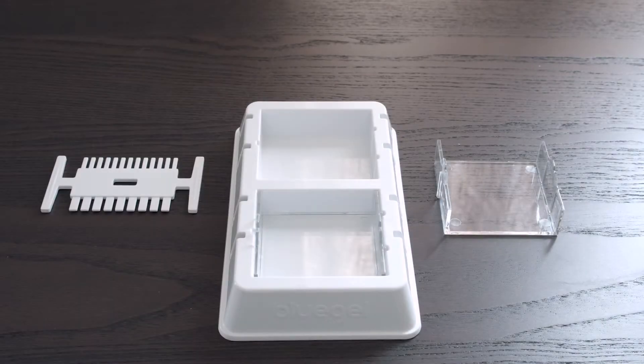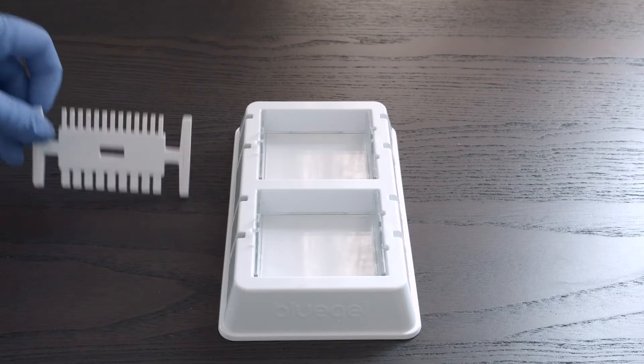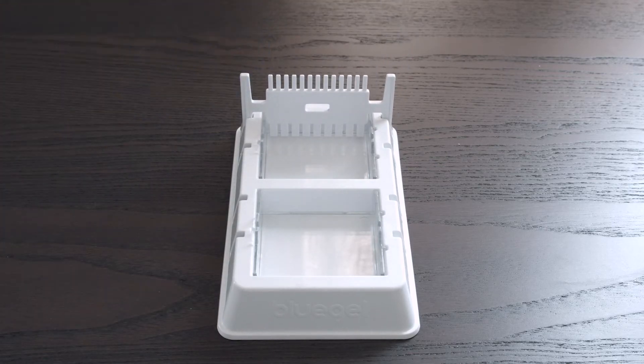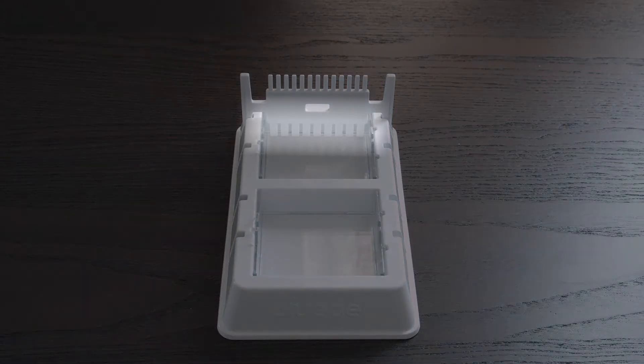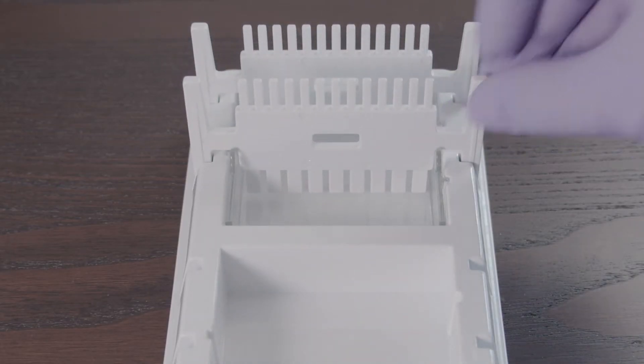Before pouring your gel, you want to set up your gel casting platform. Place the clear gel tray into the white casting platform. Place the comb in the notches of the platform at the end of the gel tray. For newer users, we recommend placing the larger nine-well side of the comb facing down. If you need more wells in your gel, you can add a second comb to the second set of notches.